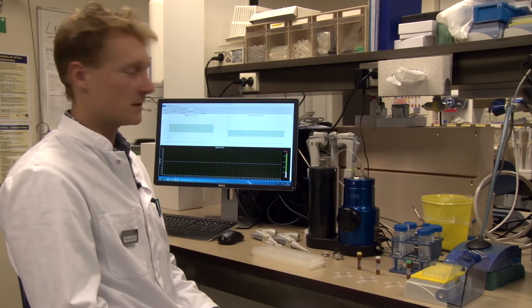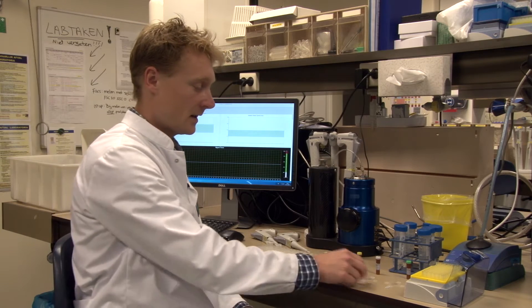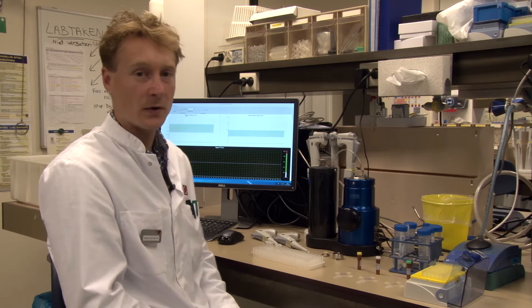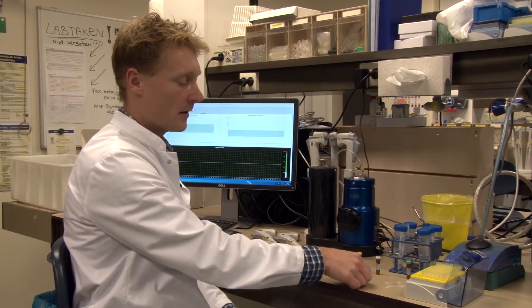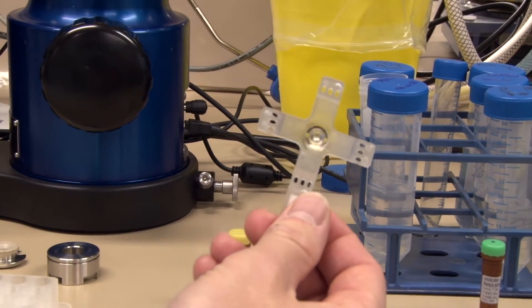For resistive pulse sensing, we use the Qnano from IZON, which you can see here. The heart of the Qnano are the nanopores. Here you can see three different pores with different pore diameters. Today we are going to use a pore which is optimized for the detection of 200 nanometer particles.